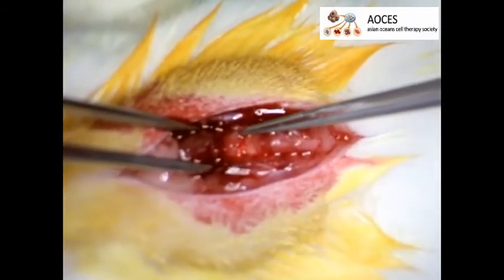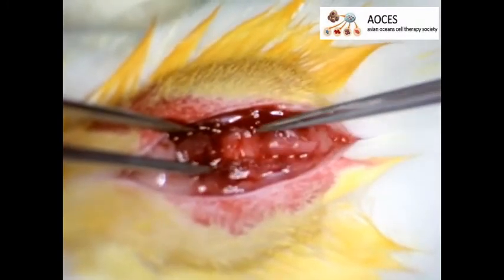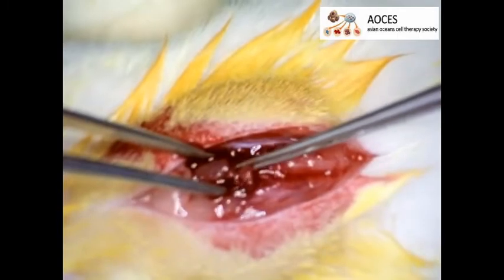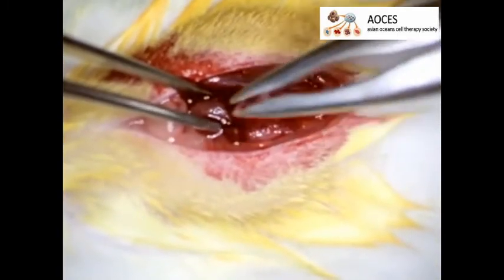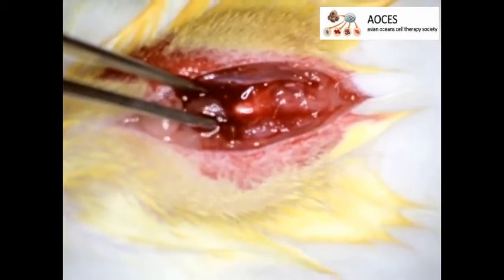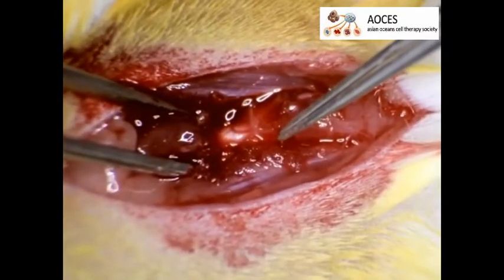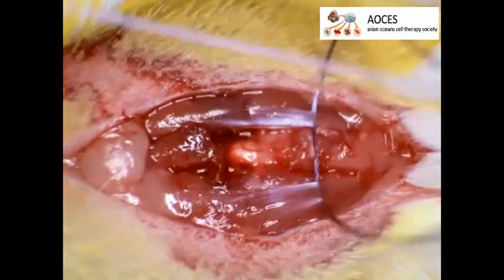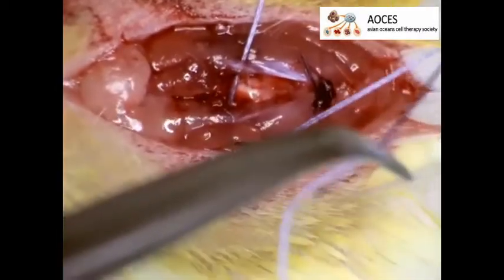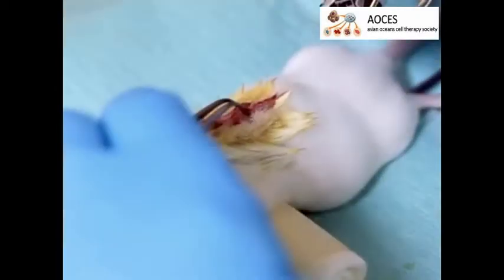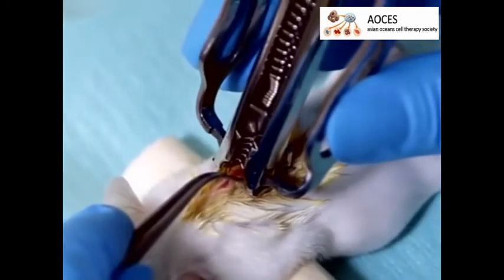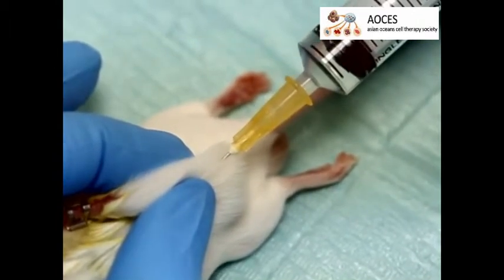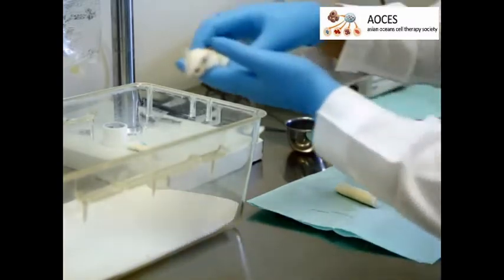Use forceps to remove the muscles from the lamina and open a small space between the vertebrae. Then gently insert the micro scissors under the bone. Cut the lamina on both sides and use the forceps to remove it, exposing the cord. Use the rongeur to remove any free or jagged bone fragments left behind. Then remove the top half of the T9 dorsal process. After following the IH impactor device protocol according to the guidelines in the text, use 4-O absorbable suture to close the incision by first covering the exposed spinal cord at the site of the removed lamina. Taking care not to pinch off the underlying muscles, use 2 or 3 reflex clips to close the skin. Inject 2 ml of saline in the lower back subcutaneously and place the mouse in a pre-warmed cage on a heating pad to recover.